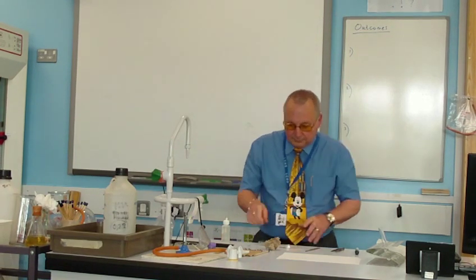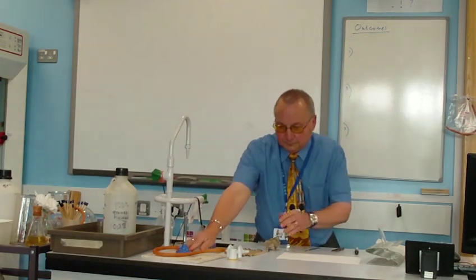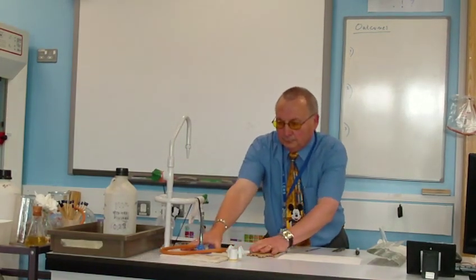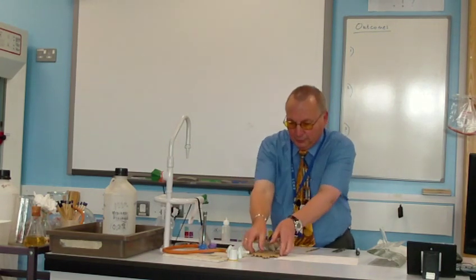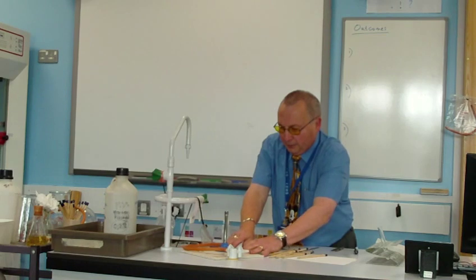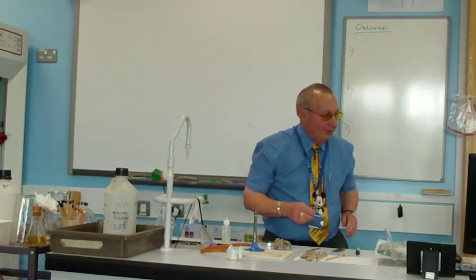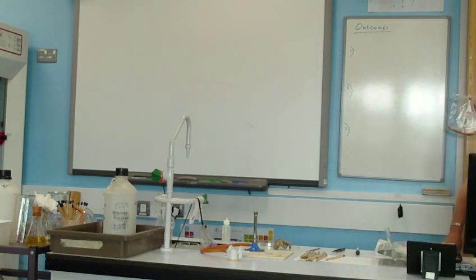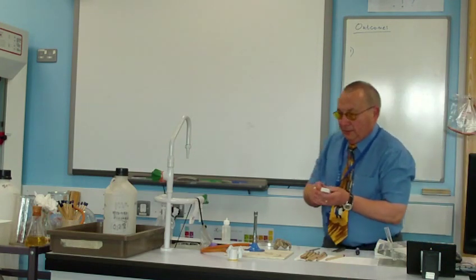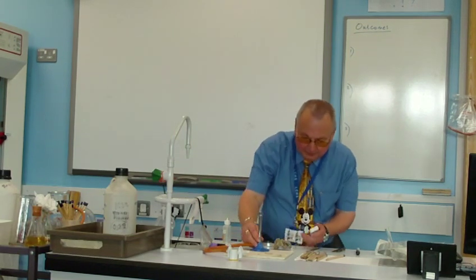So, the experiment you're going to do, I need the Bunsen again for this. I can pull it to a safer distance. Now we've not got any of these bubbles floating about. Oh, it's still on.